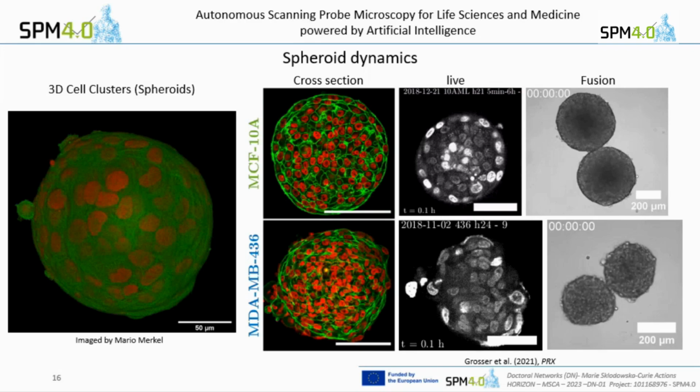I have just a curiosity about the spheroids. Are they doing it with multicellular spheroids or just cancer cells? Because mixing them with fibroblasts or other cells that you can find, then it gets really complicated. And this one I showed you was just from one single cell type, just a look at non-cancer and cancer. Colleagues of mine are currently doing this in cervical cancer cells. Of course, you can also mix cell types and stain them differently. It's very complicated. Here it was about basic stuff, about the shapes, how they change, and how it is connected to motility.